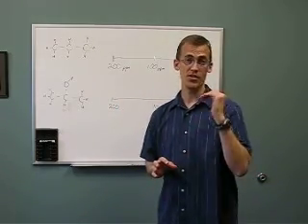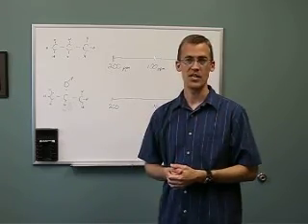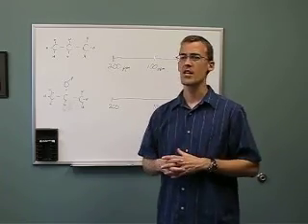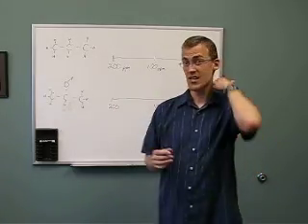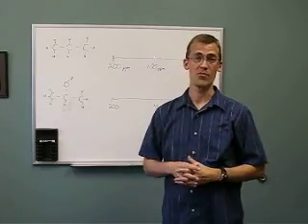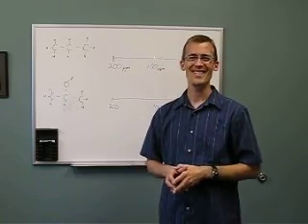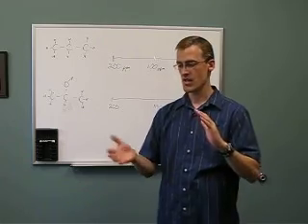For the most part, think of your body, all of your atoms have nuclei that are spinning and rotating. They all have little electromagnetic fields, and they're all kind of interacting with each other. But if you were to try to figure out which direction they're all pointing, they would, for the most part, look a little bit random. But if we could put you inside a very high-powered magnet, this is what happens in the MRI.